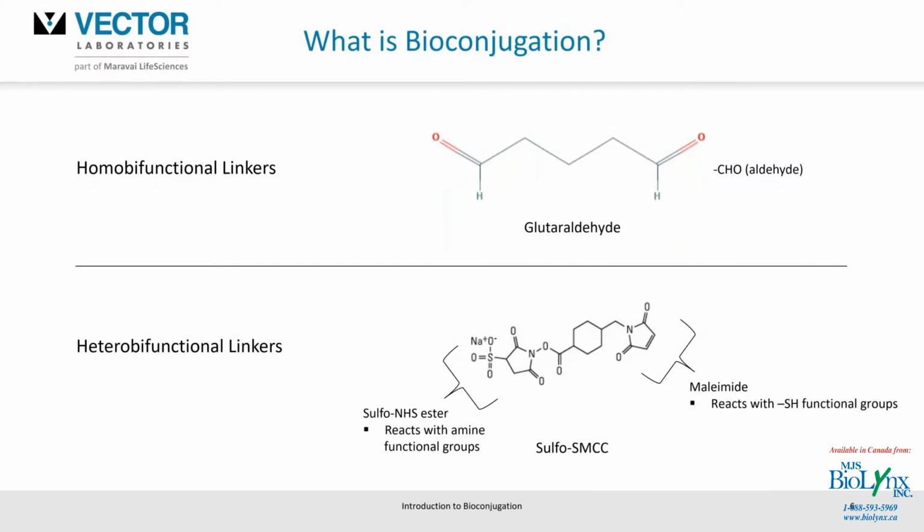So you can certainly utilize this, and this is a molecule called sulfo SMCC. You can certainly look at that. It's a very popular molecule for conjugating to antibodies and other components as well. All right, so this is pretty much the extent of the biochemistry. We won't be talking about organic chemistry.